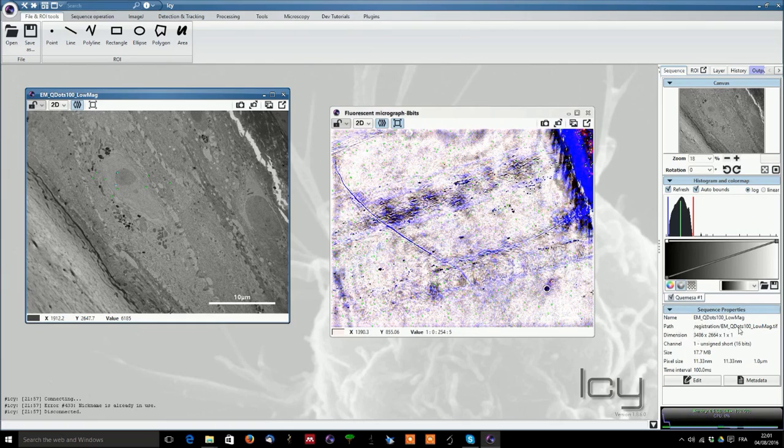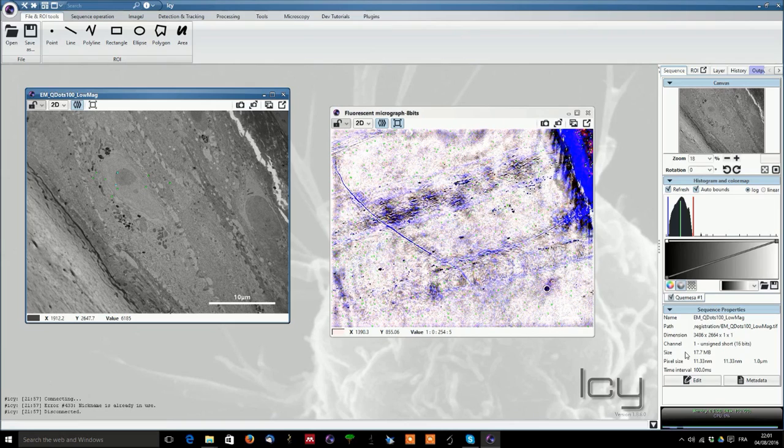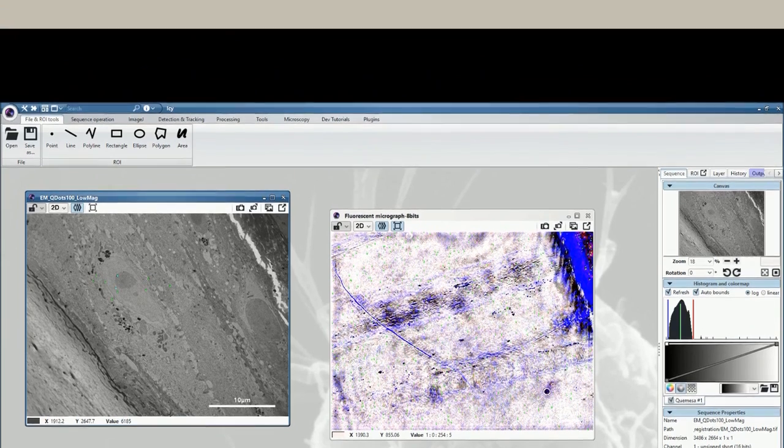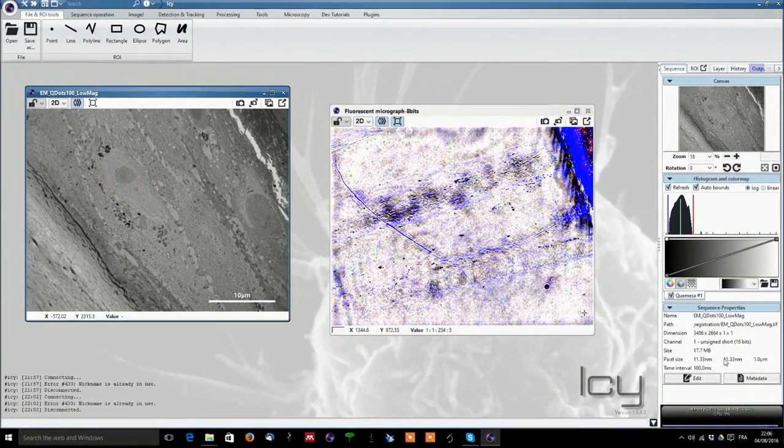Here we have the channel anglet. This one corresponds to the camera we have been using and we have here the name of the picture, the location of the file in that place.